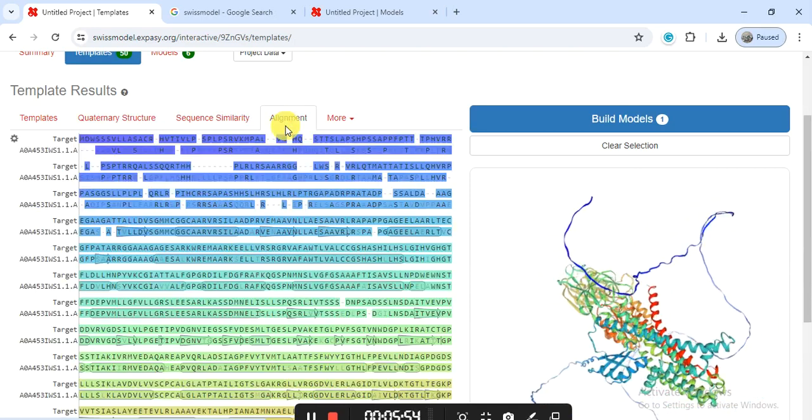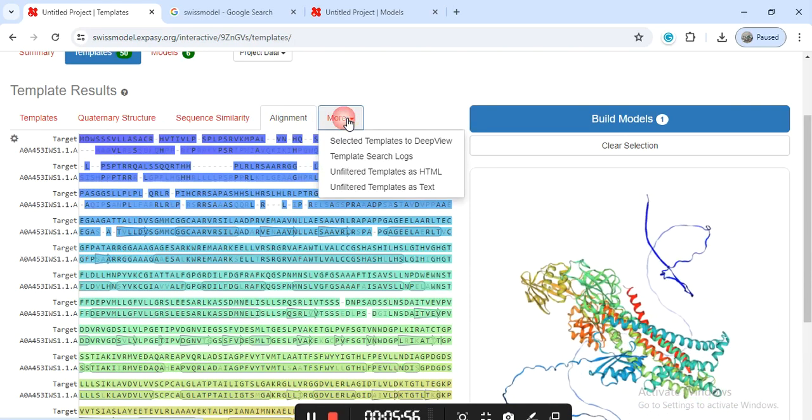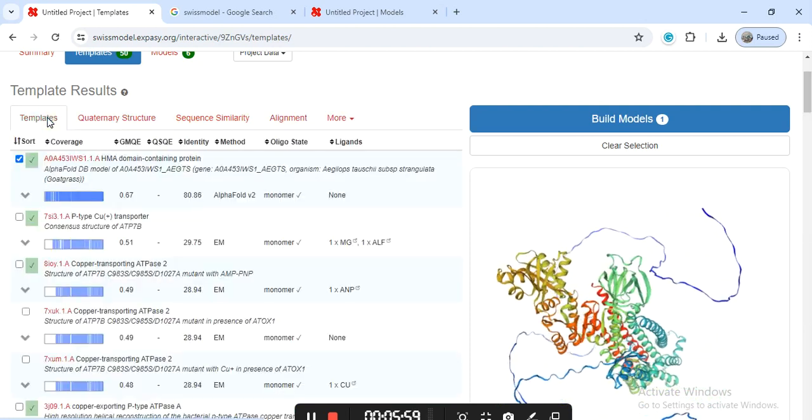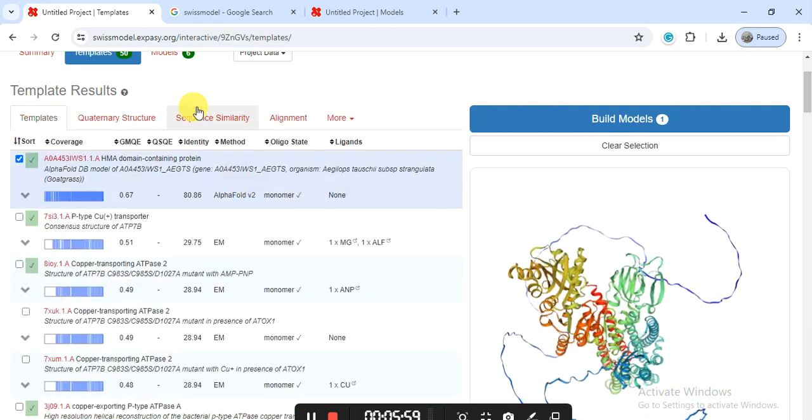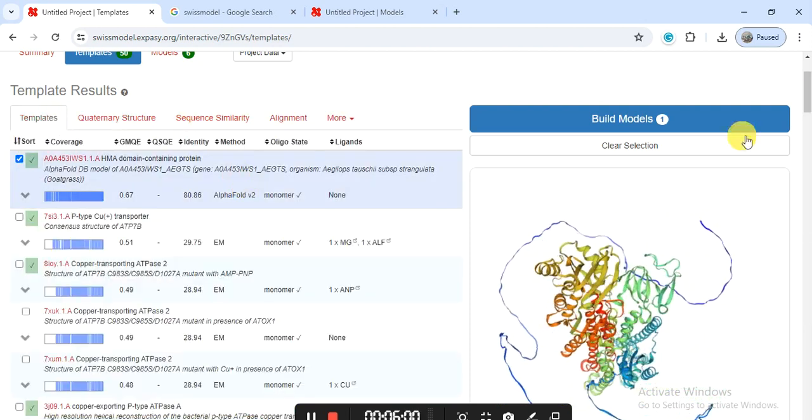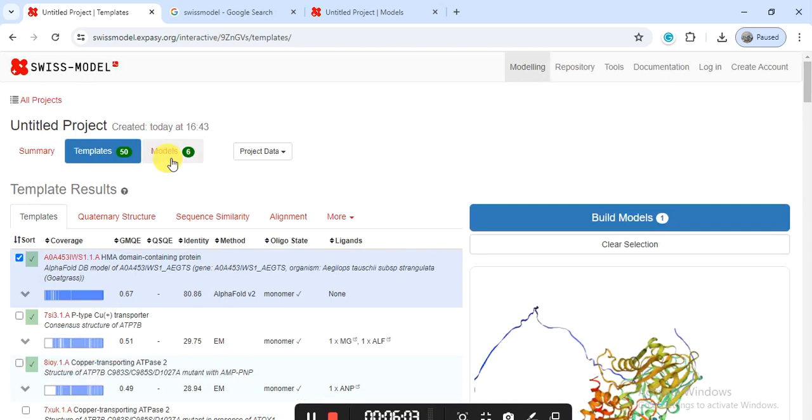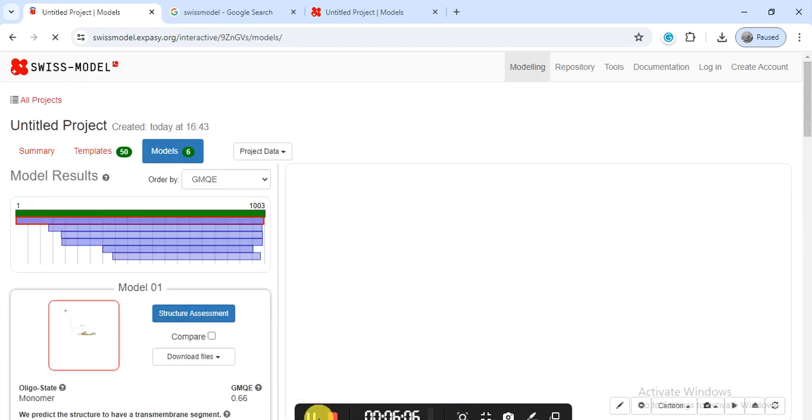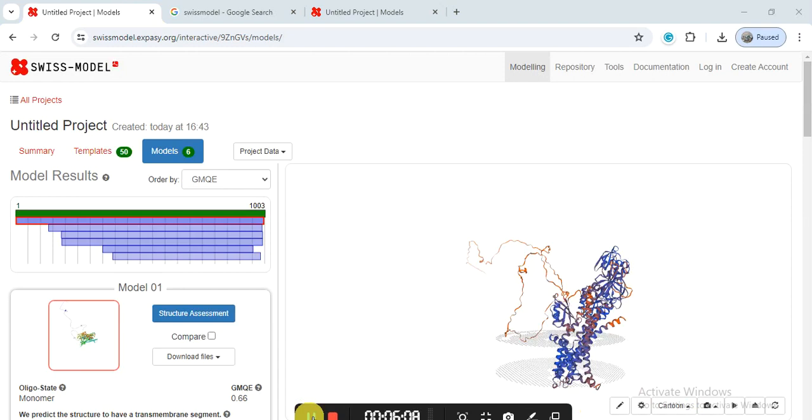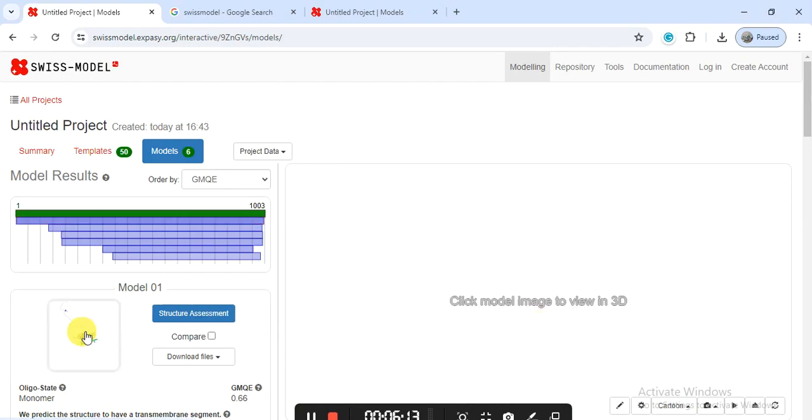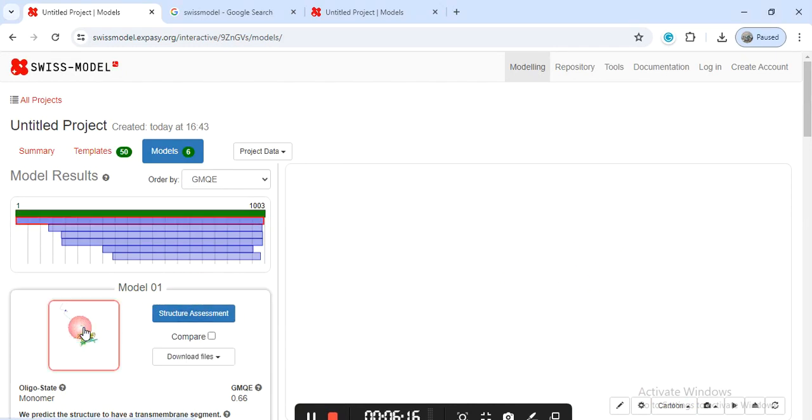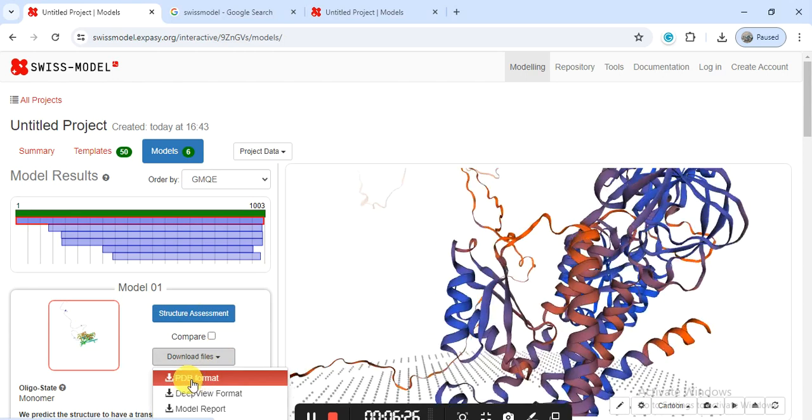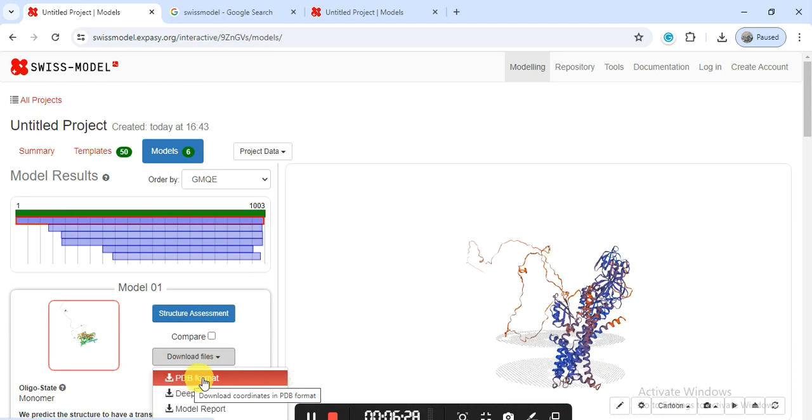And here when you click on model, it will appear like this. When you click on it and select it, the structure will come. And from here, from download files, you can click and download that PDB file. And this PDB file, you can also use it in any other software that you are using, like PyMOL or any other tool to make it more beautiful.